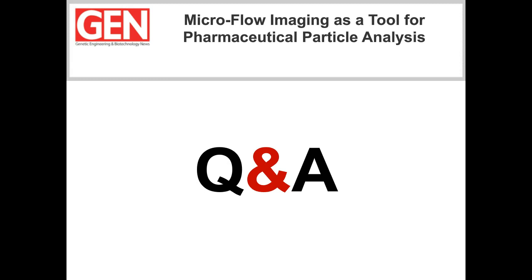We use the filter manager in the View Analysis Suite software, where we select the ECD, so the equivalent circular diameter, and the aspect ratio. And we set up the aspect ratio over the circularity, because with this aspect ratio we were able to have more power to distinguish different particle size populations like fines and monomers and agglomerates.